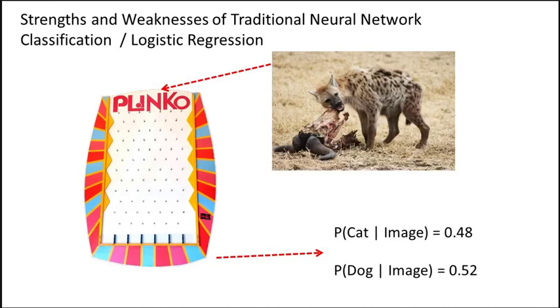But if we train this neural network only using dogs and cats, but then throw in a few monkey wrenches, imagine we throw in a hyena. A hyena is not technically a dog or a cat. It's got a lot of features of both. And this is a failure mode that we'd want to see in a classifier. We put in an image that was unknown, from a completely different class that the network is not supposed to do a good job training on. But what it says is, I'm very confused. It's basically a coin flip between a dog and a cat in this particular case.